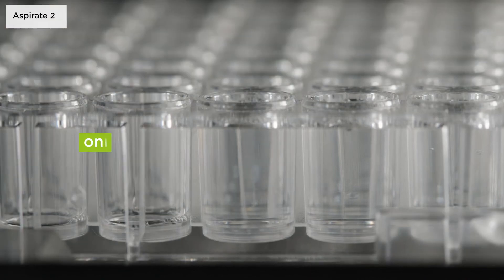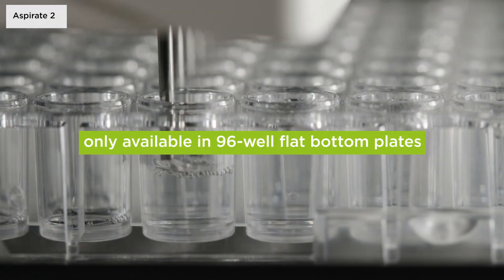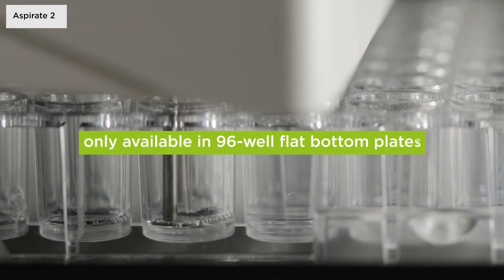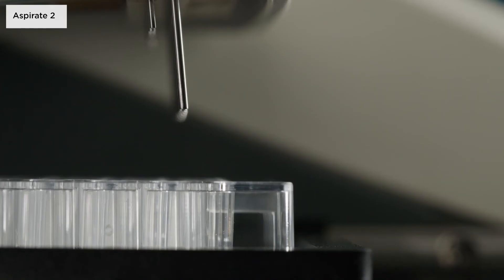Crosswise aspiration is only available in 96 well flat bottom plates, where a second aspiration position can be defined, typically close to the front of the well to reduce the residual volume.